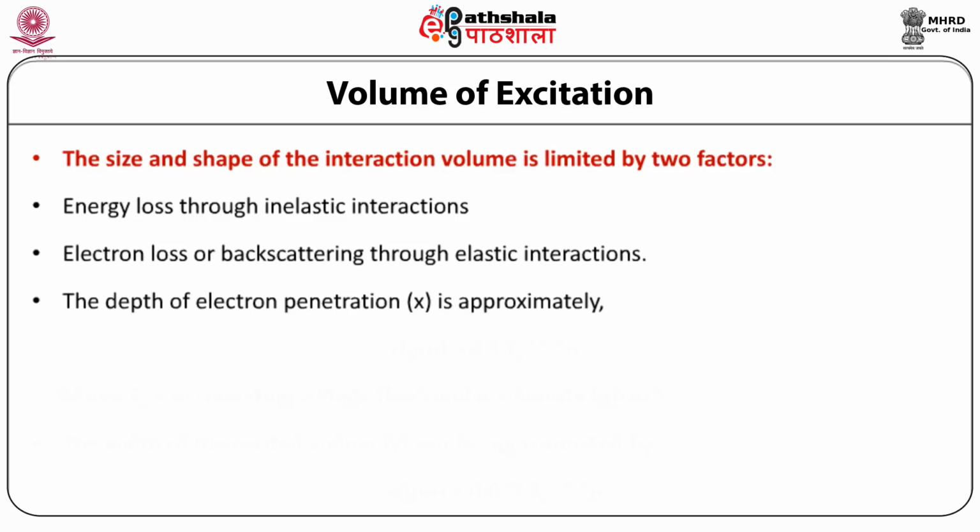Depth of penetration for an electron beam and the interaction volume of a sample are functions of the angle of incidence, magnitude of current, the accelerating voltage, and average atomic number of the sample. Electron penetration generally ranges from 1 to 5 micrometers, with the beam incident perpendicular to the sample.